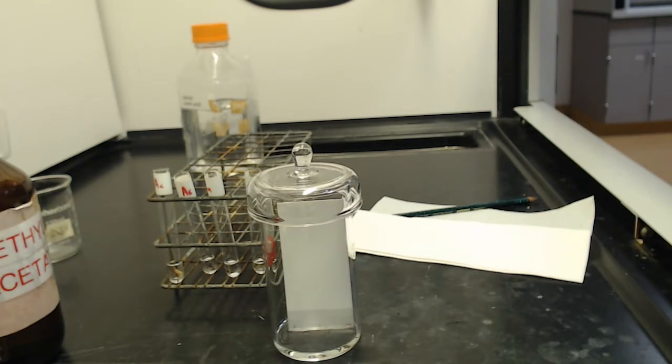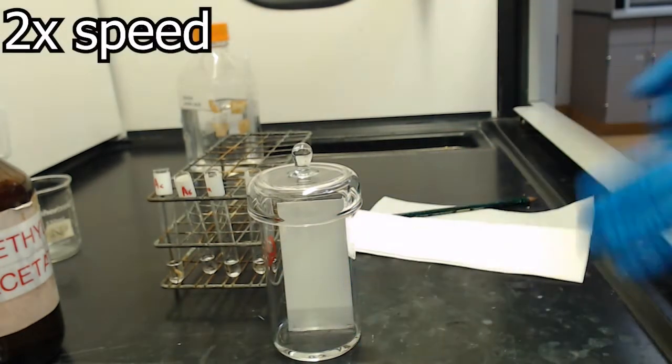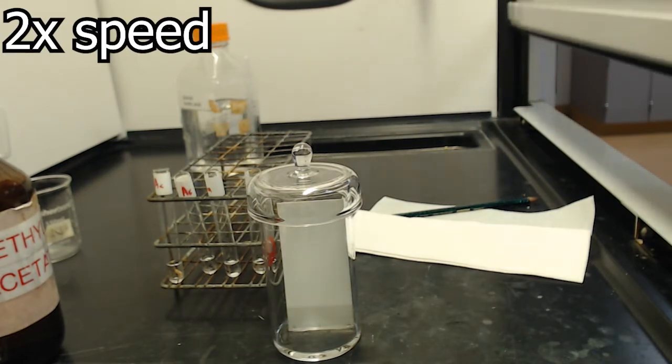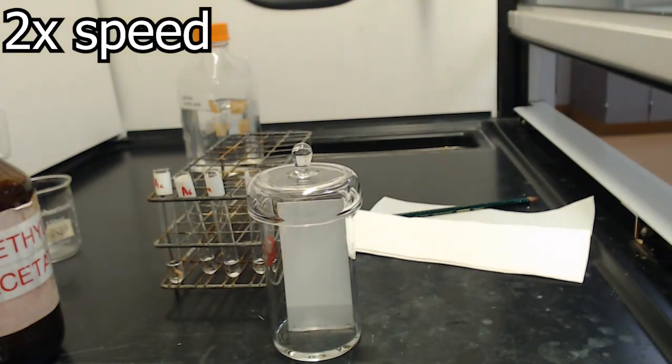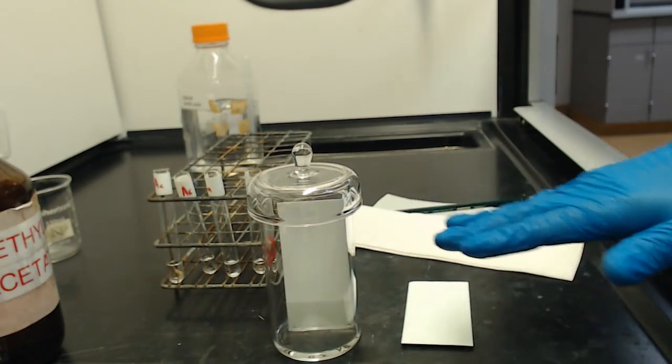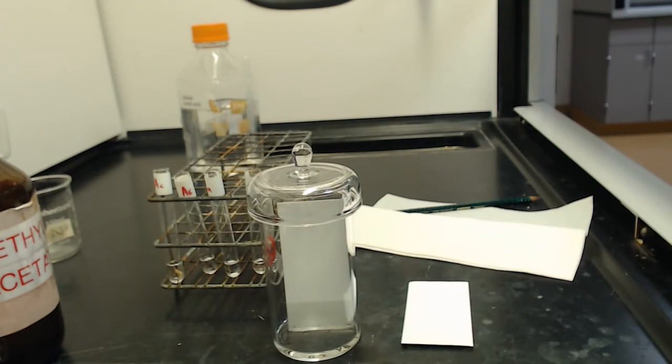While that's running, I'm going to go ahead and prepare our other plate for our last sample and then our unknown. When handling your TLC plates, make sure that you handle them by their edges. Forgot to mention that earlier. Especially you want to have gloved hands, because if you're touching the tops of them without gloves, the oil from your skin will show up on your TLC.